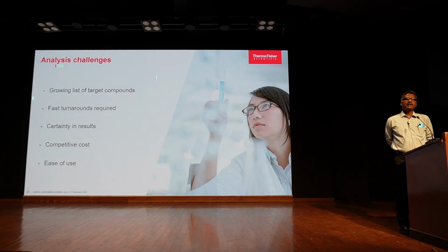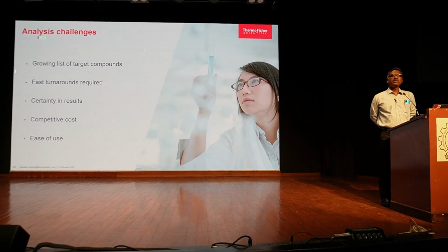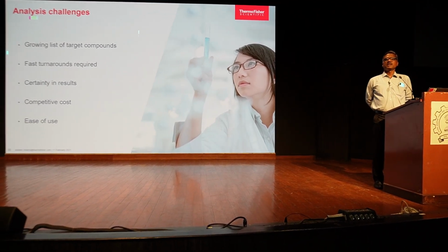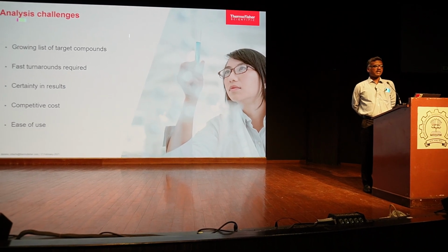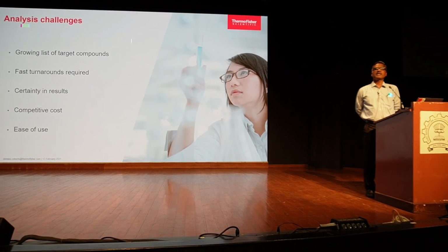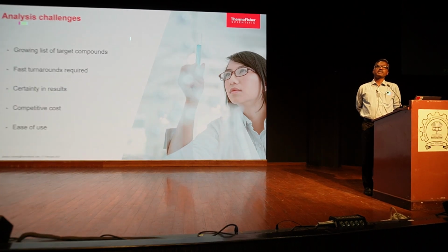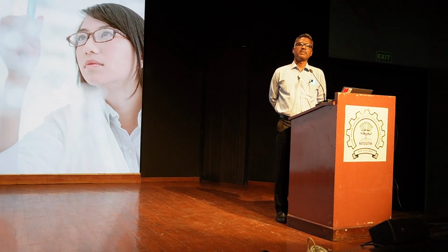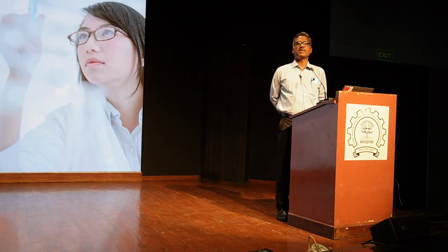So why has GC-HRMS been considered the best solution here? When we talk about the analytical challenges for such chemicals, they are very thermally stable and not easily washed out. So we need to consider what type of extraction conditions need to be followed and what kind of analytical approach we should follow to get accurate and precise results. That is a very important aspect.